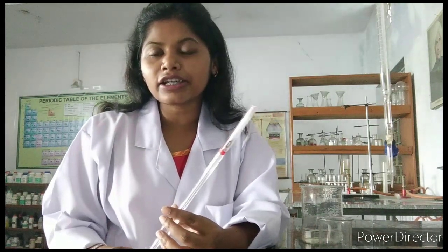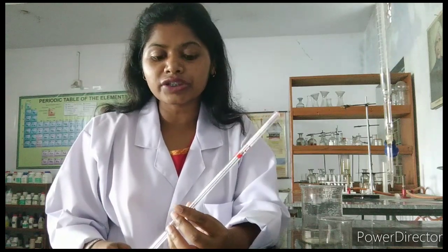With this pipette we can measure the exact volume of liquid that we are going to use in our practical. Generally we use 10 milliliter or 20 milliliter of solutions, and with this apparatus we can measure the exact volume of the liquid. I am going to show you today how we use the pipette.